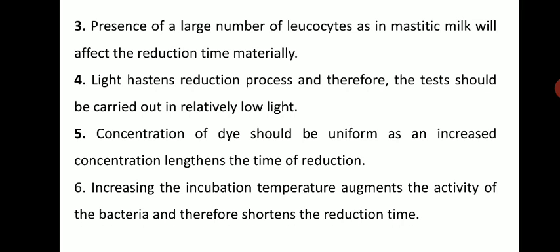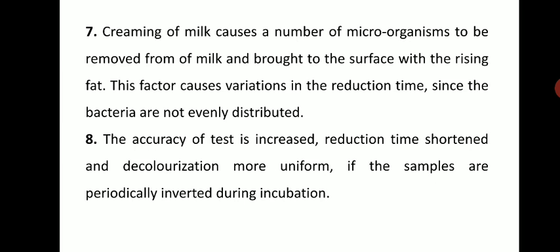Creaming of milk causes a number of microorganisms to be removed from the milk and brought to the surface with the rising fat. This causes variation in reduction time since the bacteria are not evenly distributed. The accuracy of the test is increased and decoloration is more uniform if the samples are periodically inverted during incubation.